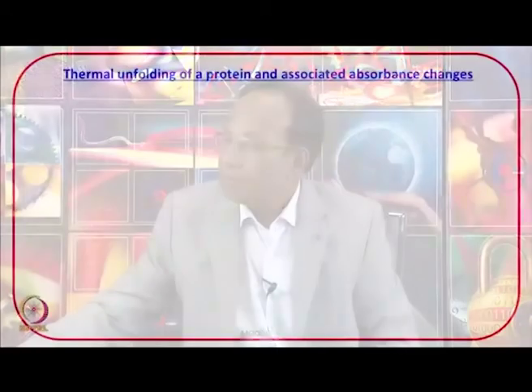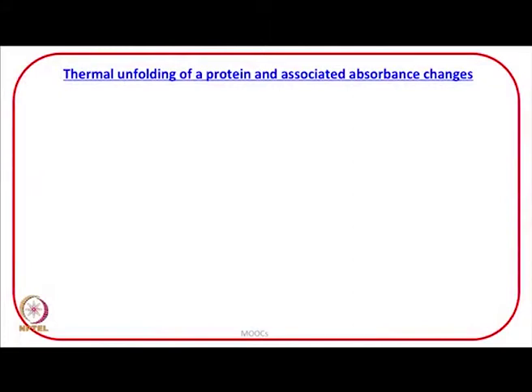Now, let us go ahead and talk about the thermal unfolding of a protein and associated absorbance changes. When a protein is subjected to heat, in other words, when we allow thermal unfolding of a protein, when the temperature is increased, as we discussed earlier, at some temperature, there will be cooperative unfolding.